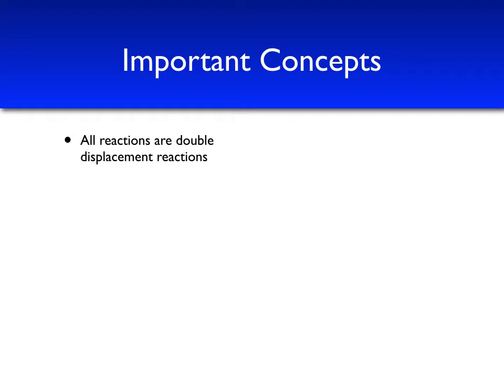There are 3 types of double displacement reactions you will see, and you've probably seen them both in lecture and in this lab course. First are the precipitation reactions, which result from the mixture of 2 strong electrolyte solutions to form one ionic compound that's insoluble in water. We can deduce the identity of the insoluble compound using the solubility rules, which can be found in your textbook.